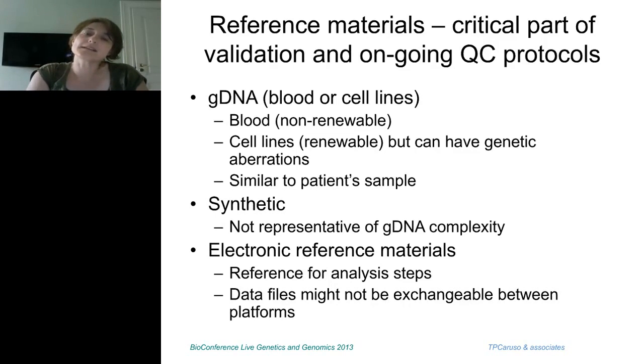The other part is the reference materials, and those are critical for development, validation, and ongoing QC. And people tend to ignore this and say, oh yeah, I have this sample that's been sitting in my freezer for 10 years. It has those really precious mutations. I'll just use this to validate or test my new assay.